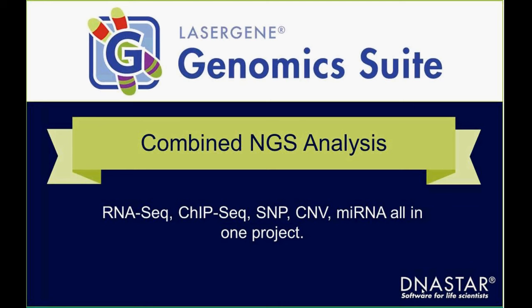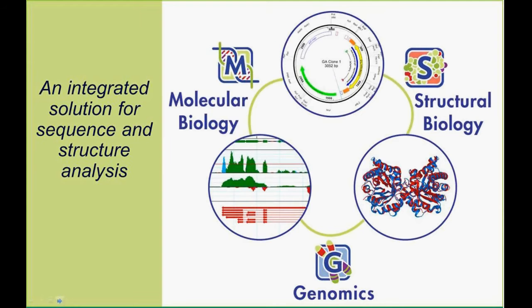So, combined analysis is specific to NGS, but the DNASTAR software really covers all different areas. If you're new to DNASTAR, please be aware that we have a full set of molecular biology tools, a full set of structural biology tools, as well as what we're going to talk about today, genomics tools.